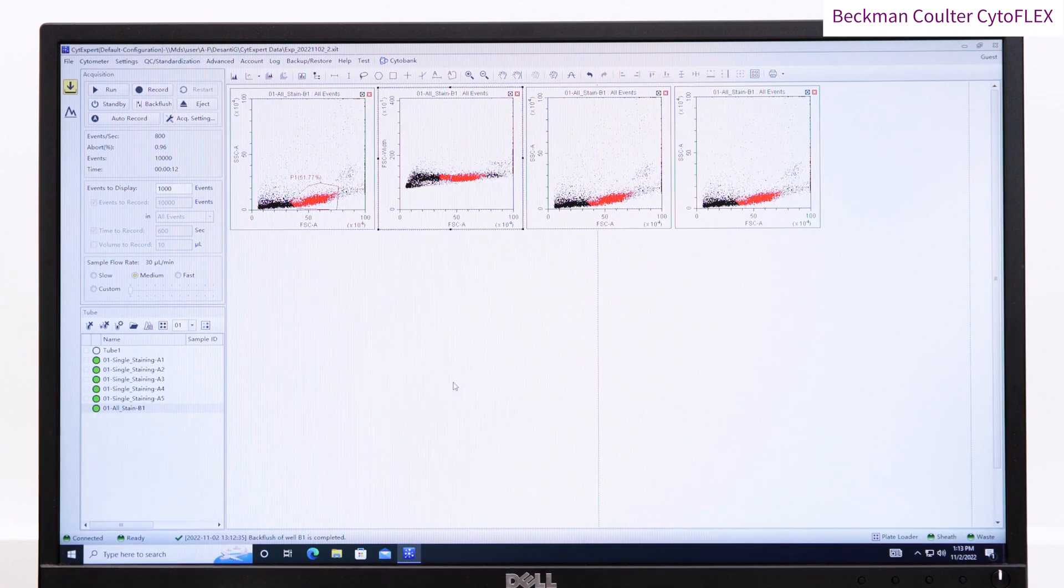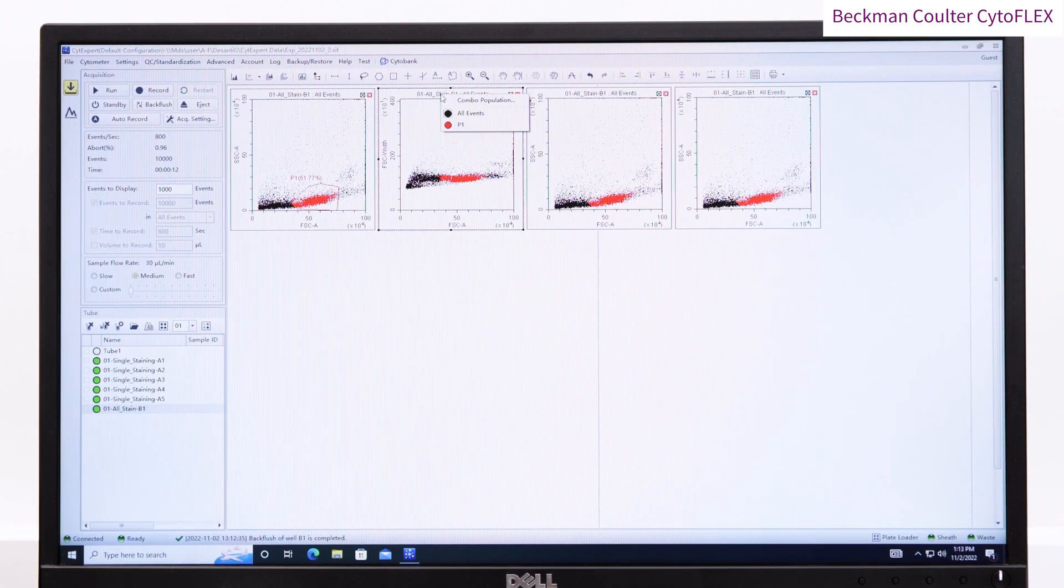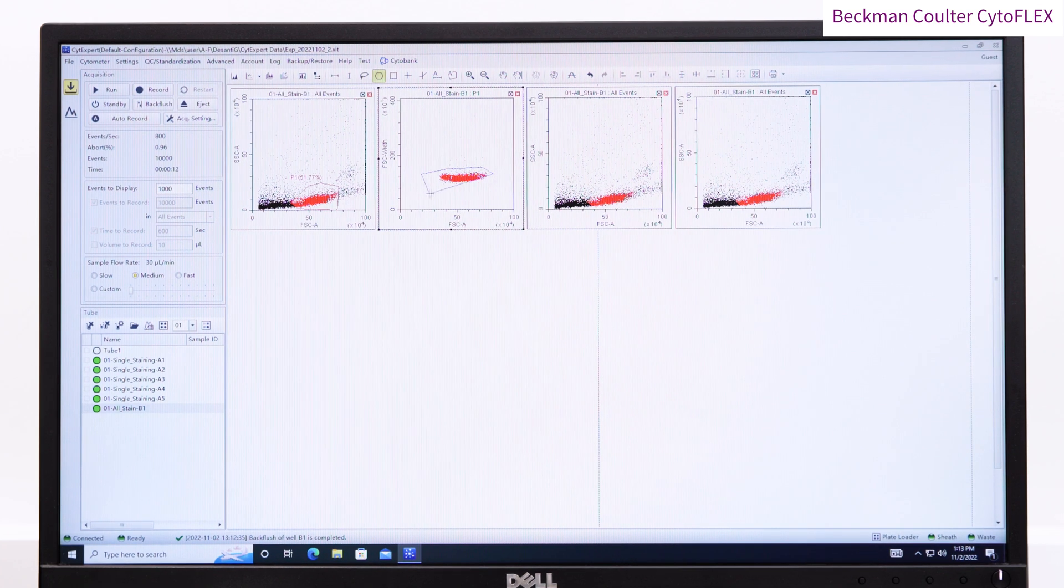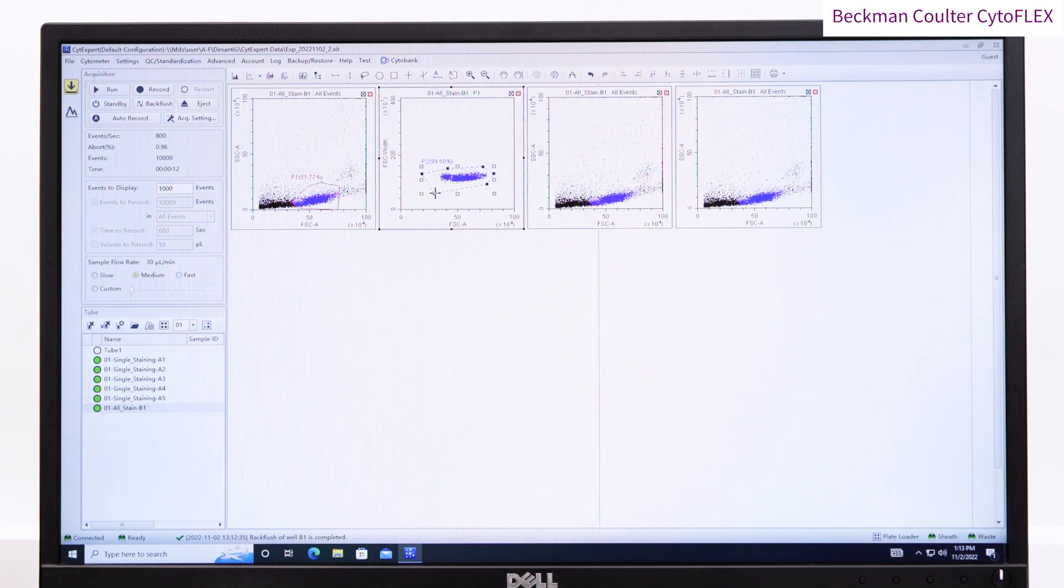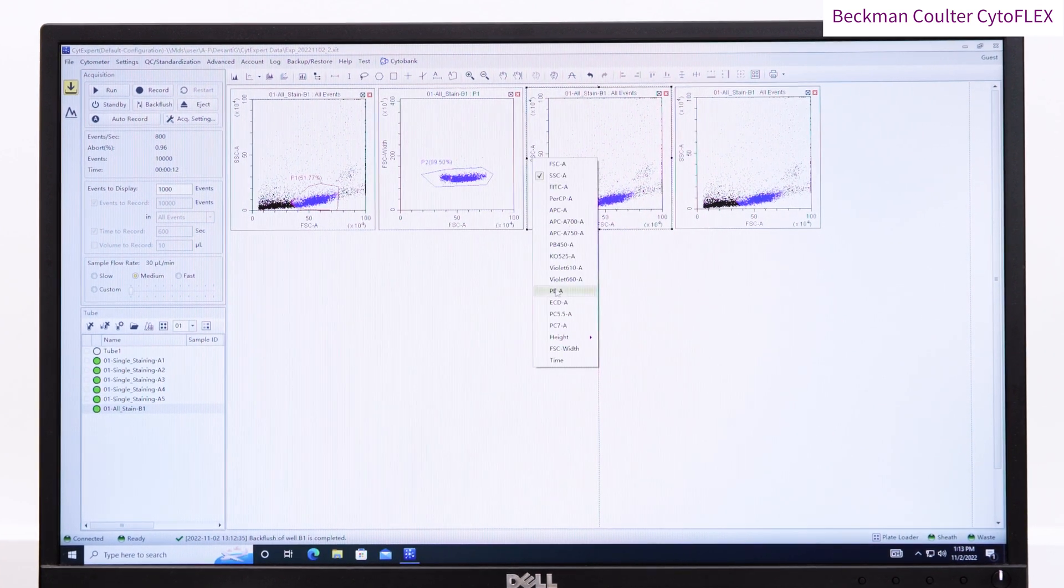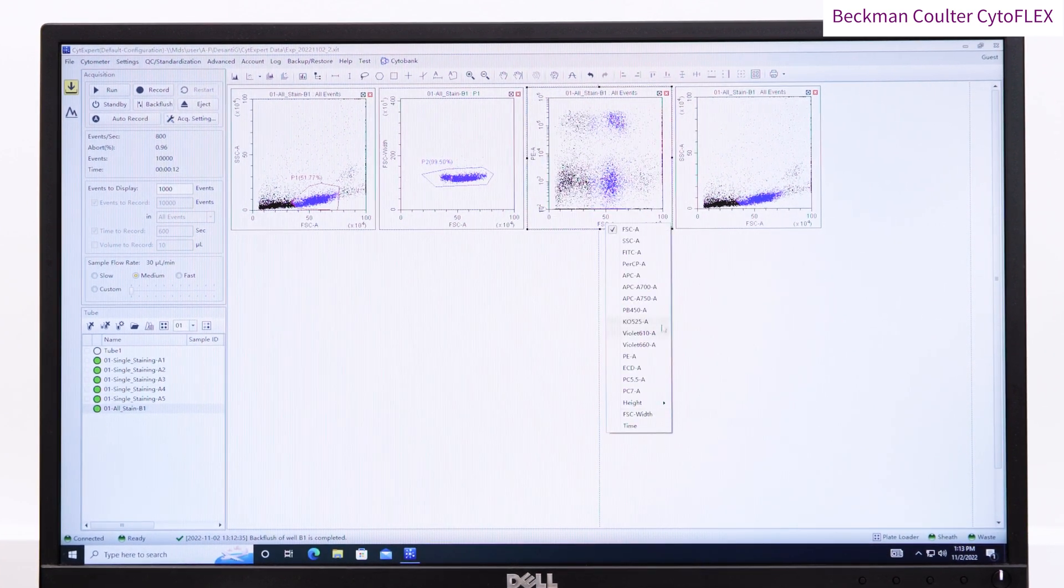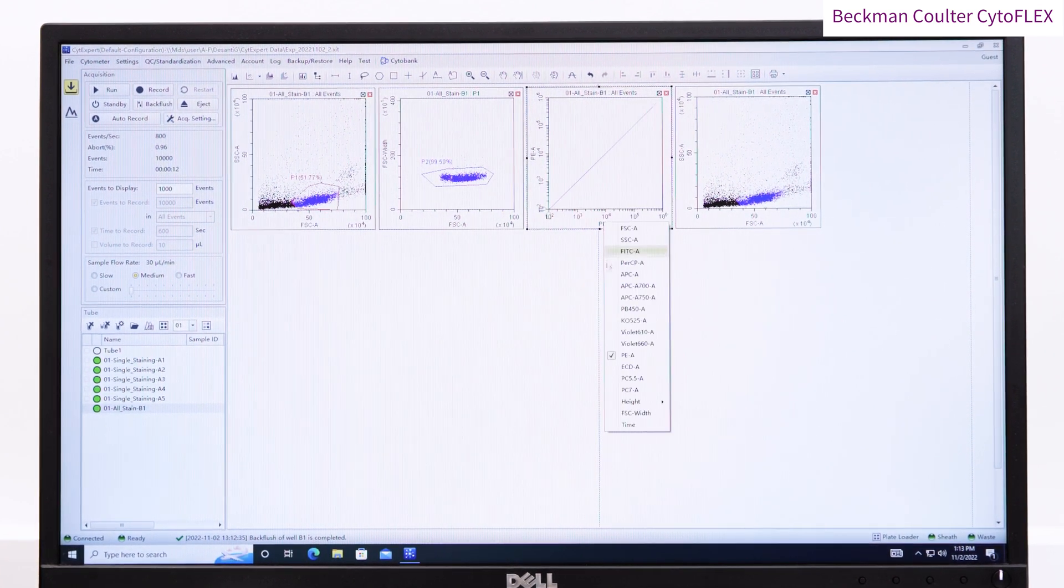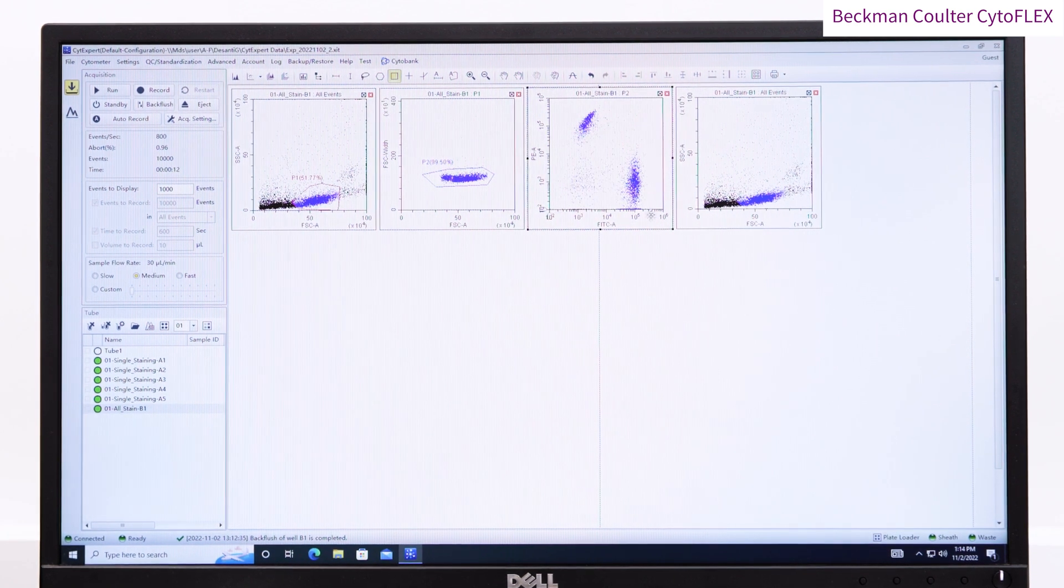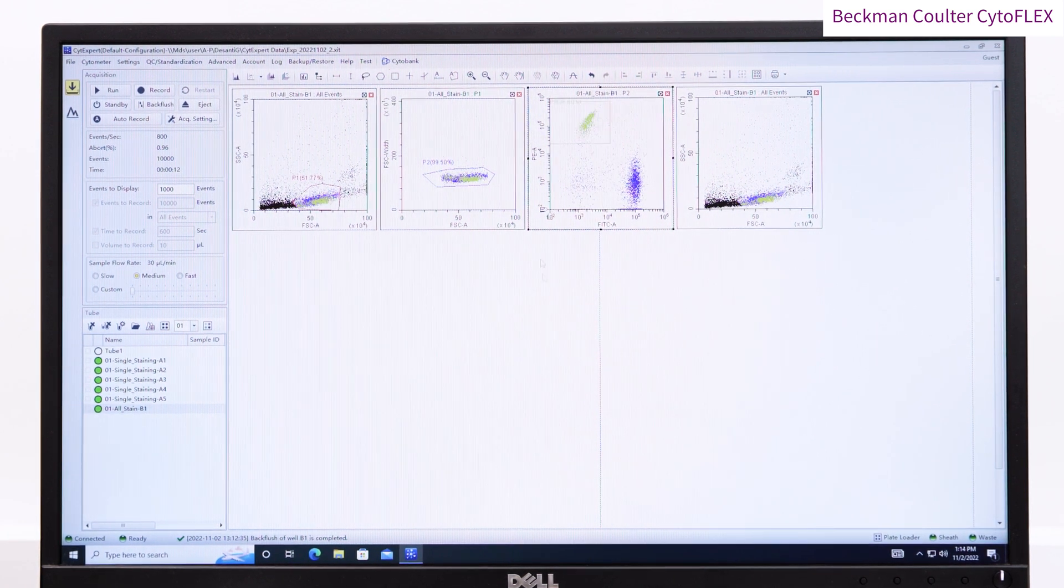Note that your cells may be off-scale. If they are, drag them on using the hand tool, or by right-clicking on the plot and choosing property, and either press auto or manually enter a data range.